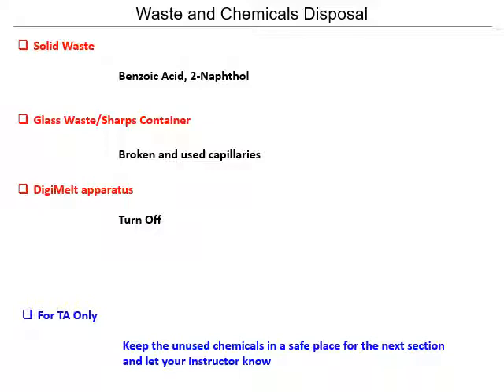And this waste and chemicals disposal is wrong. It'll be liquid waste that you have to dispose of, right? Think about where you have to put those wastes. Again, you can email me to try to figure it out with me, because it'll probably be in the quiz as well.